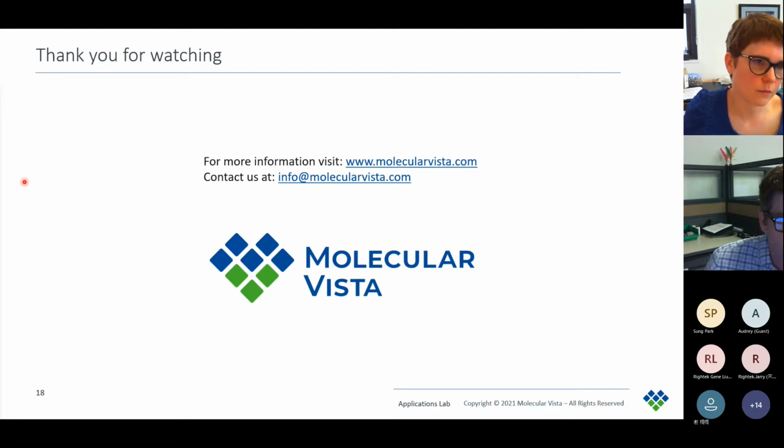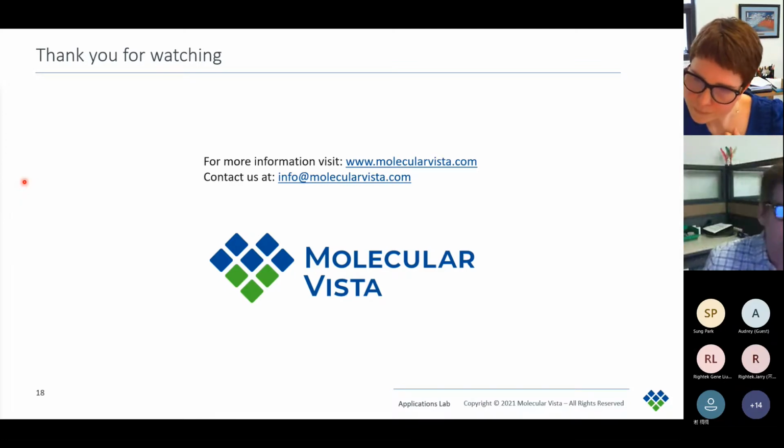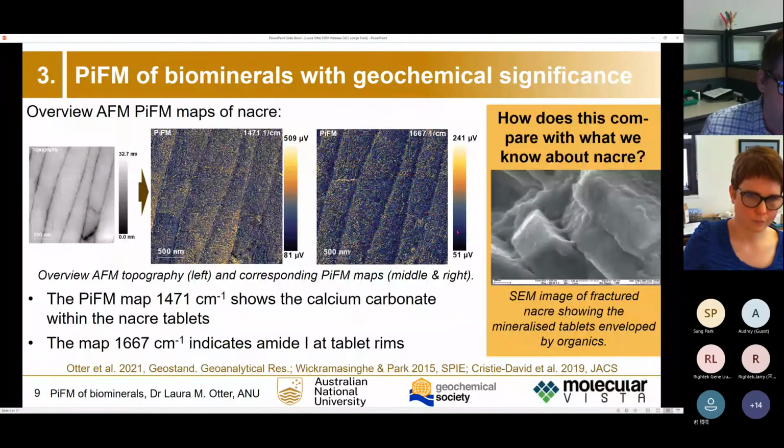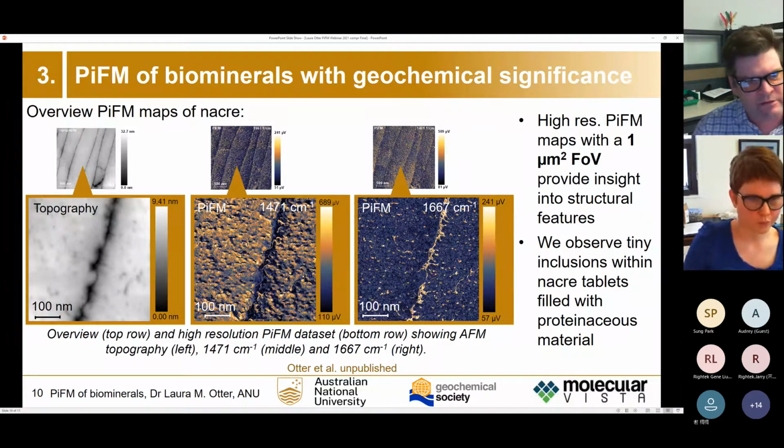Yeah. Well, if you don't mind, let's go back to your presentation. If you look at the topographic heights, we're talking just tens of nanometers on those polished cross sections. Which one would you like to see? This one? Actually, any of these are quite fine. Even the image you have here on the left really shows just 10 nanometers. So the polishing seems to work quite well. I just wanted to highlight for those in the audience that this shows the ability to not require anything special in terms of sample preparation.